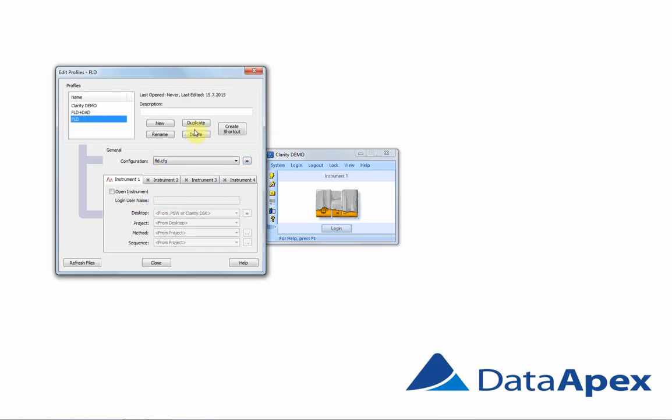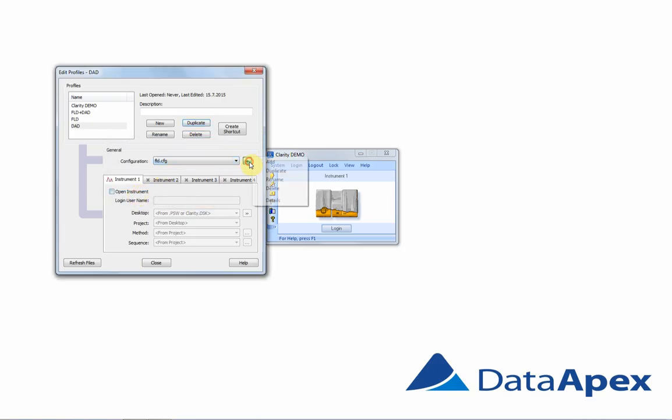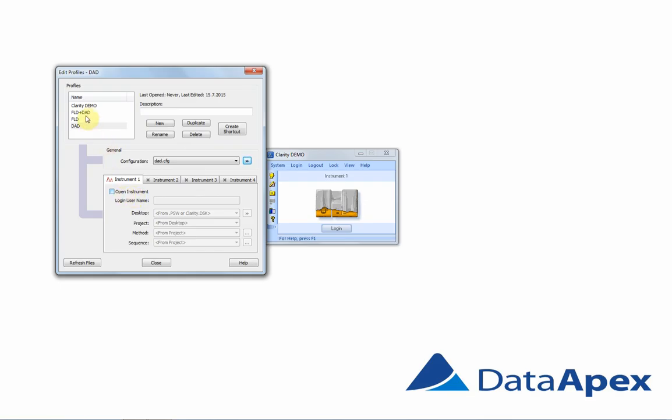We can create a duplicate of this profile and call it DAD. Once again, we will duplicate the configuration, DAD and click OK. Now the profile FLD plus DAD is already configured. However, profiles FLD and DAD are not, since their configuration has been duplicated from the FLD plus DAD profile.